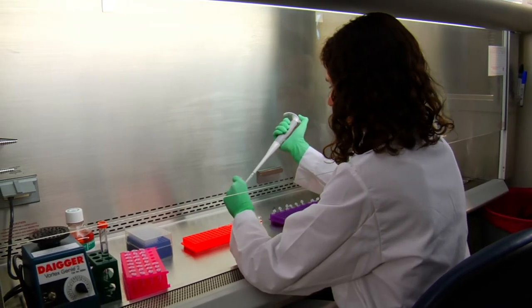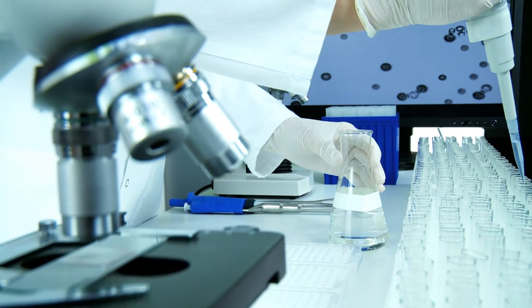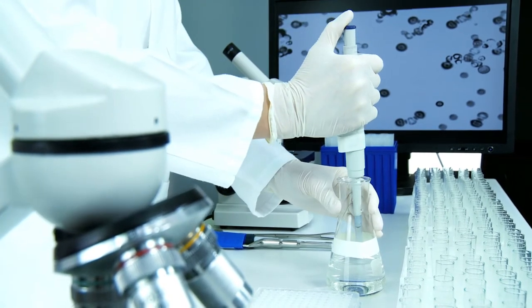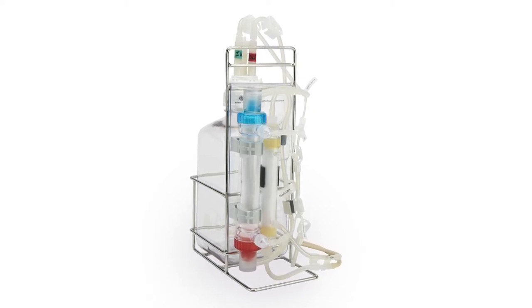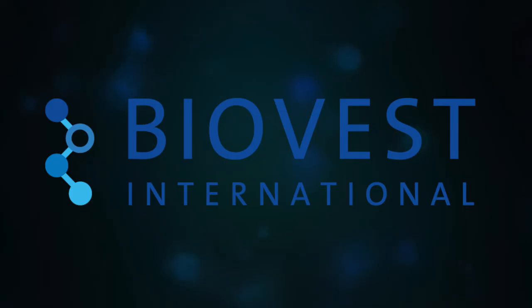When you're ready to increase cell line numbers or product volume, BioVest instruments allow you to take data generated from the Primer and use it in our larger bioreactors. Whether tapping it as a small-scale system for academic research or utilizing it for commercial uses such as producing suspension cell lines or secreted proteins, the Primer is a compact and powerful solution that's perfect for your laboratory's needs.